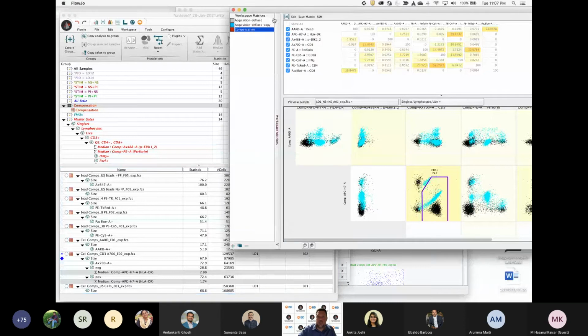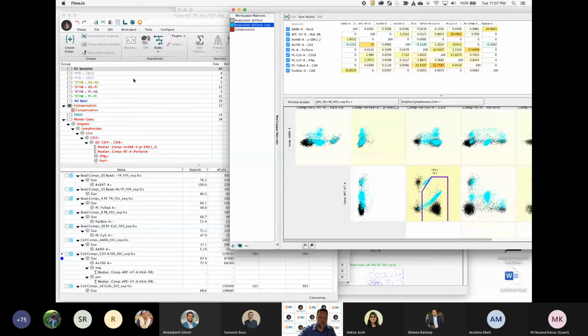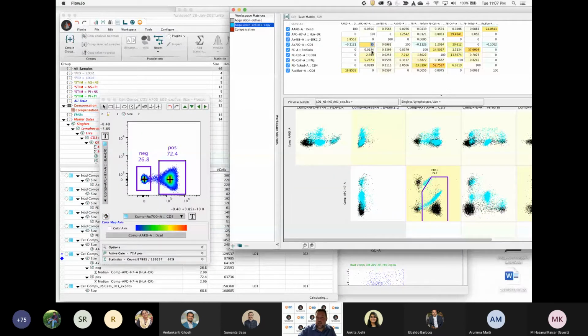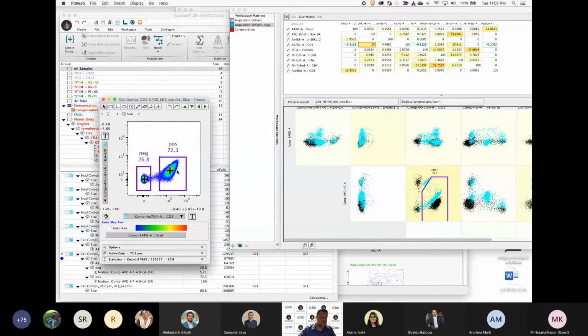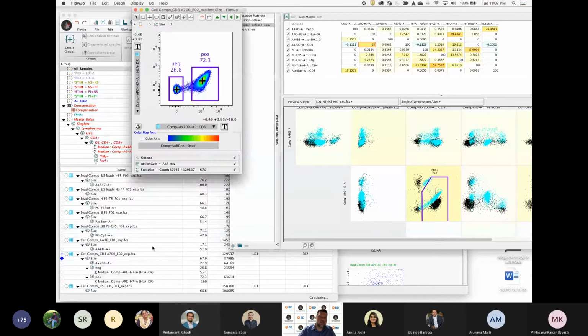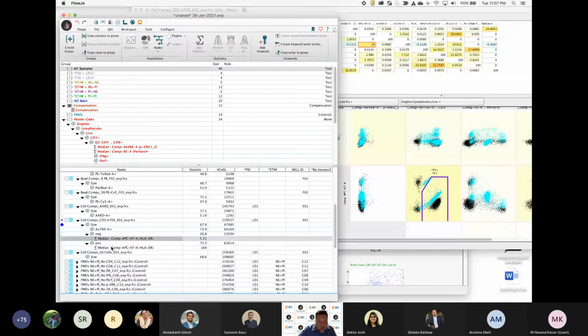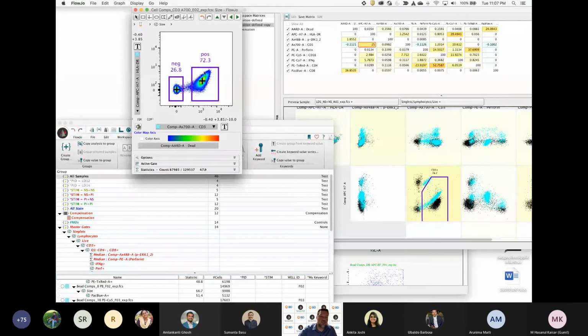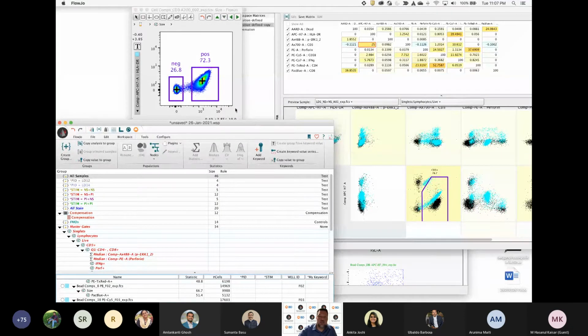I'm going to grab this acquisition defined copy, drag it onto my samples. So now I'm applying the blue matrix, and then I'll go ahead and change the matrix value from 35 to 25, right? And look what happens. The gate doesn't even move, and neither does that update, but it skews in just like we showed. And now look at these numbers down here for that sample. Median of the negative is still 5, and the median of the positive is now 160. That is completely off. It is poorly compensated. You can not only see it skewed visually, but you can see it in the medians of the two populations.